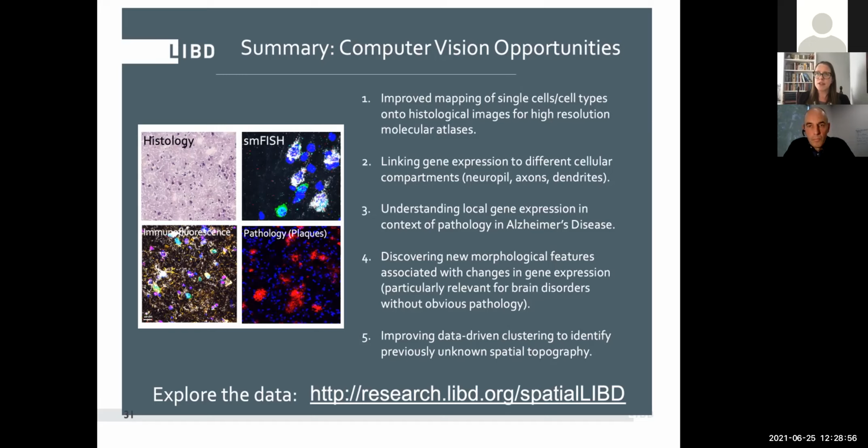So I think for data where a spot includes many cells, deconvolution has been what people are interested in. However, I think you'll see more and more, and especially even from 10x Genomics, that they're now appreciating people want higher single cell resolution.